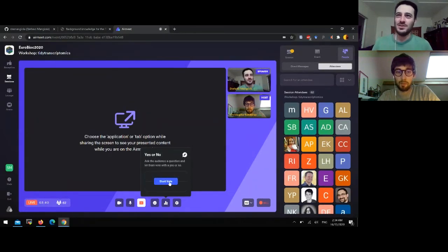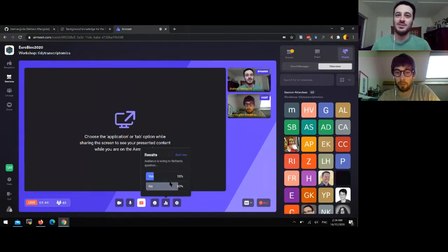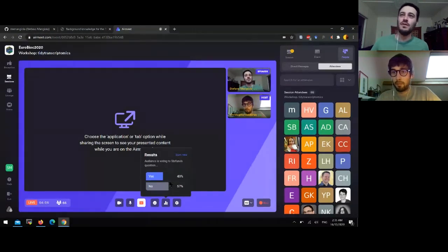The second question is about single cell. So how many of you had previous experience with single cell transcriptomic analysis? So I know how much background I need to give before I start with the actual analysis. Okay, this is 50%. So half of you had already experience with that, 60% close. All right, thanks for that.